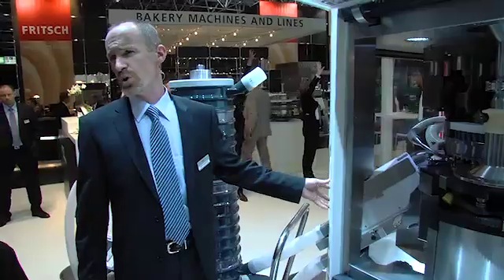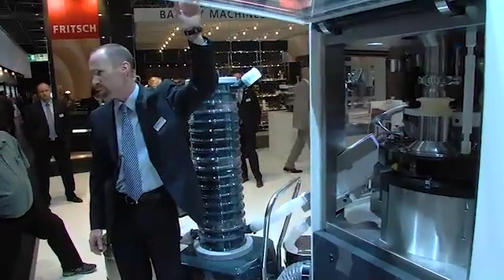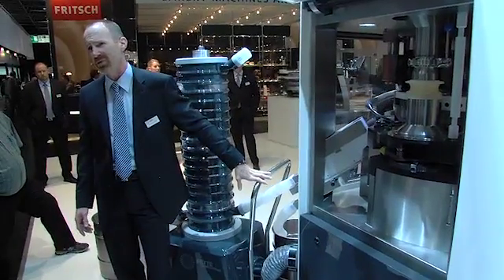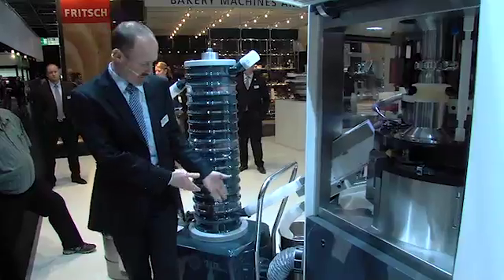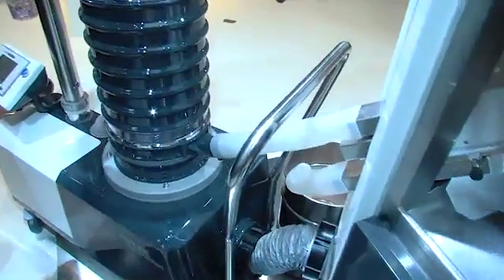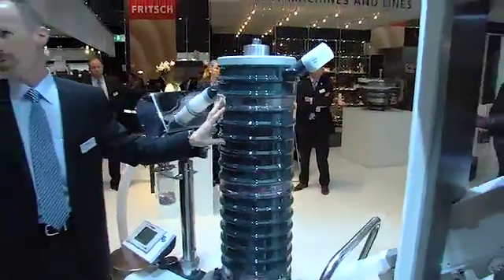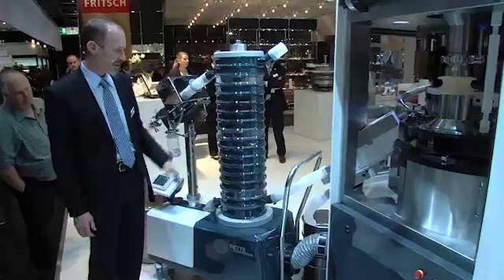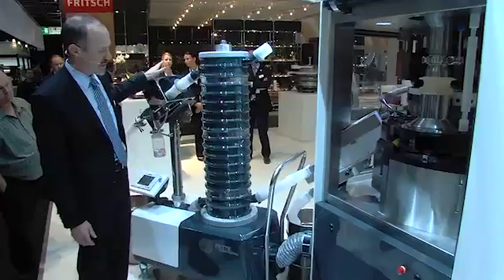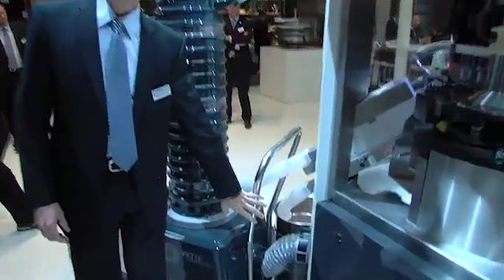Given the fact that it comes through the corner column, the user has the capability of opening and closing all of the access doors without having to remove, disassemble, or reassemble any peripheral equipment installed with the machine — as in the case of this new uphill de-duster metal check unit. This unit is the result of a collaborative effort between Pharma Technology out of Belgium and FEDA Compact in Germany. It's a vibrating uphill de-duster metal check unit in one simple unit with plug-and-play connection to the FE55.